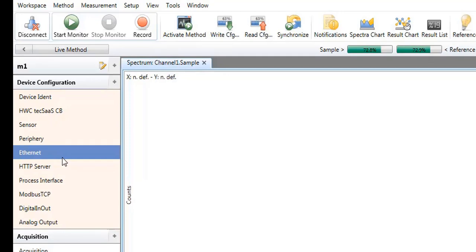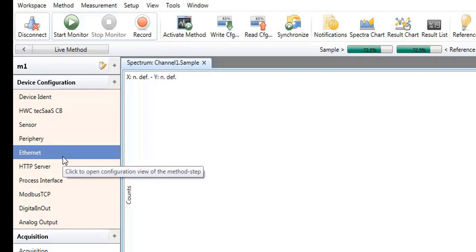In the center, you can see a window to monitor the resulting spectra.